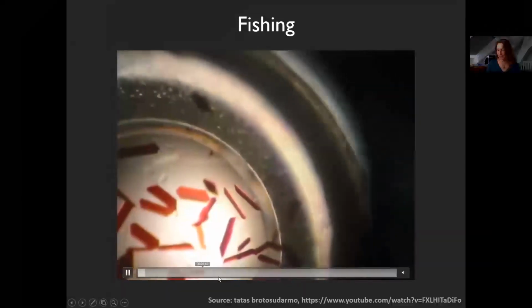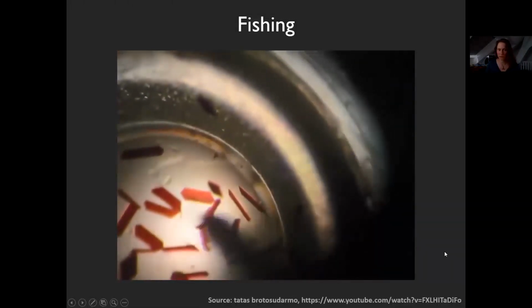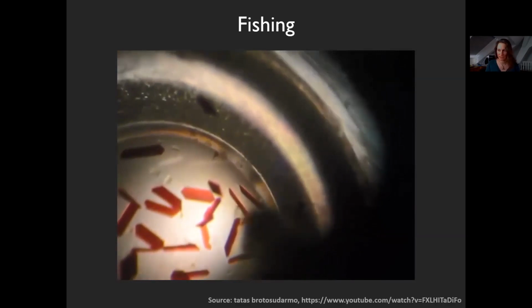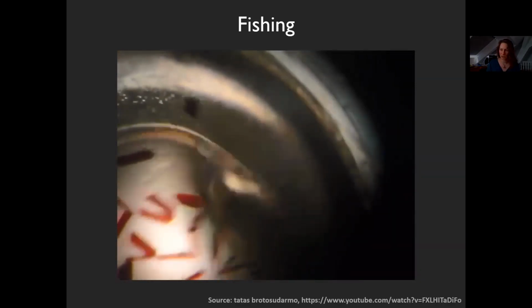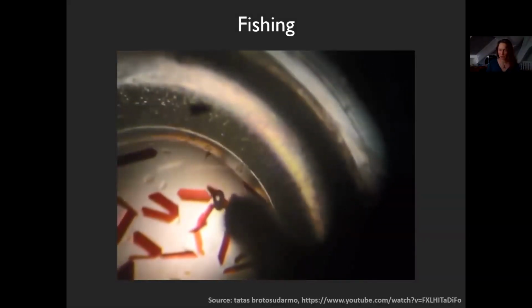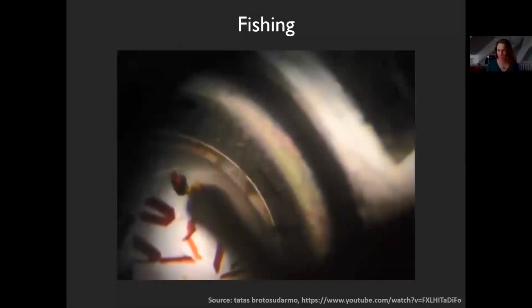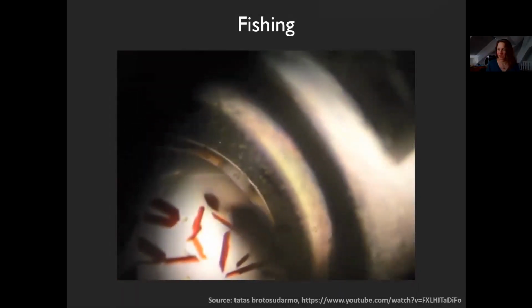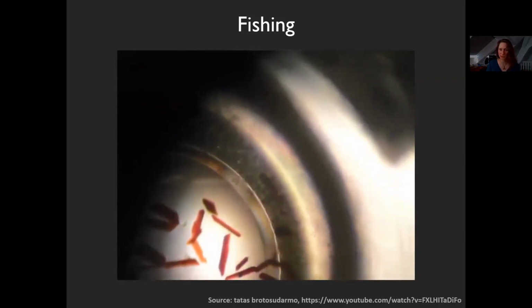I'm going to show this again because this is really a beautiful, beautiful example of how to do such a thing. In particular, given that the drop is relatively deep and it's clearly difficult to see how deep you're in or how deep the crystals are in there. Flop, and it's on. The loop is just a little bit smaller than the crystal, really perfect, not too much mother liquor on it. I would possibly wick it, but that's how you do it.